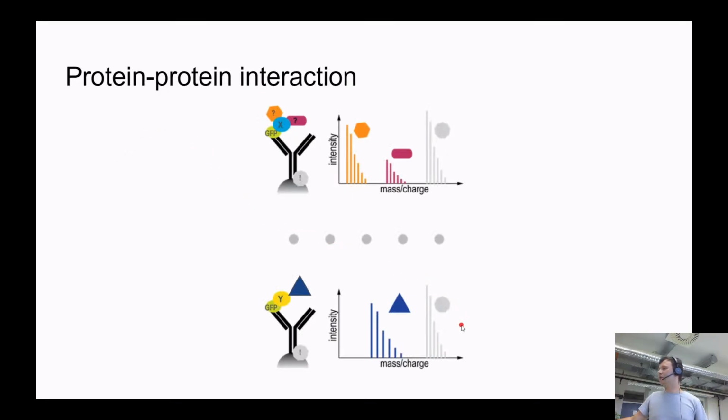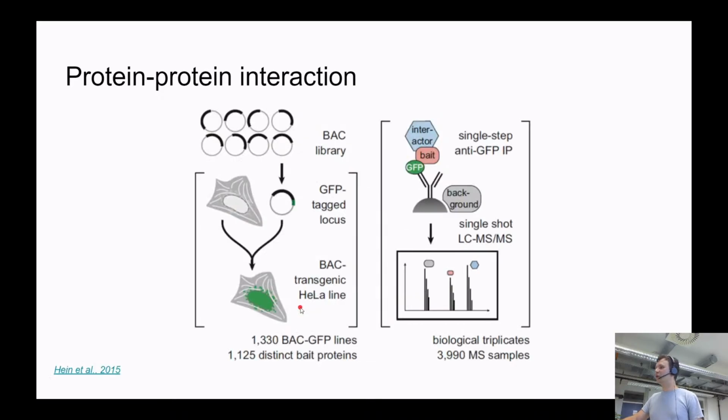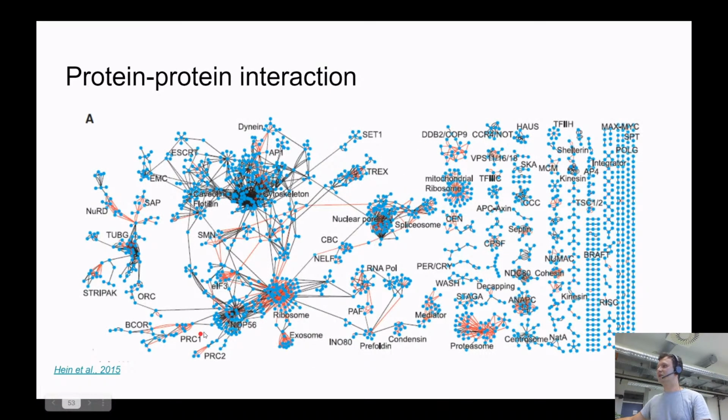Of course, you can do it not just for one protein X, you can do it for protein Y, and you find out that the background stays the same, like non-informative interactions, but informative interactions are going to vary from protein to protein. You can do replicates, etc., and you can do it not just for 1-2 proteins, but you can actually do it for 1,000 proteins. And actually, currently people are already doing several thousands of proteins. It's extremely powerful because you can really see something like that.